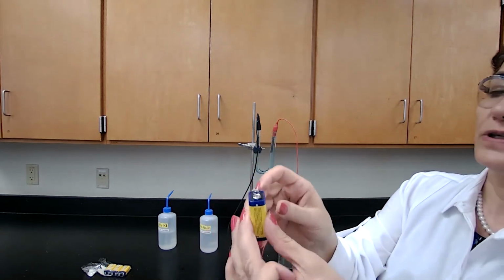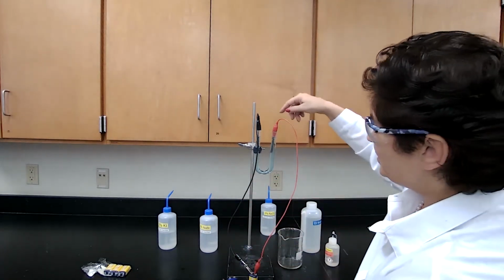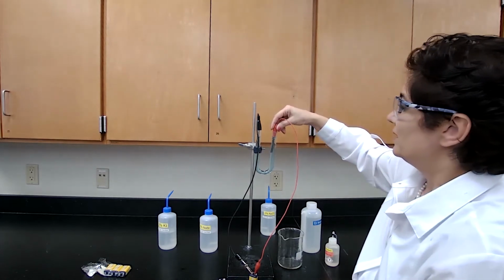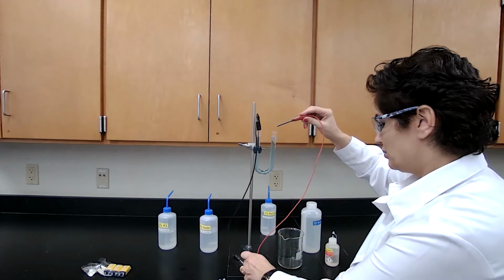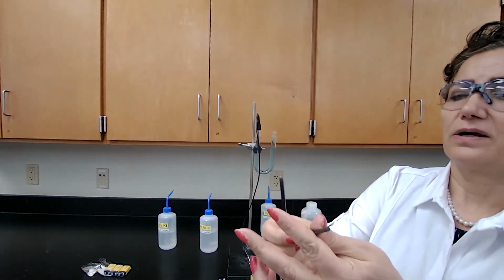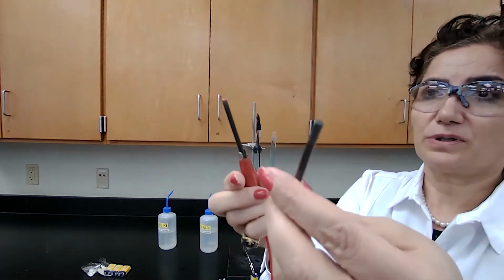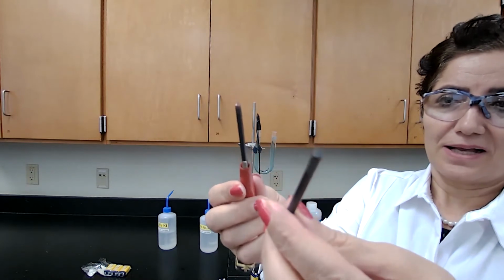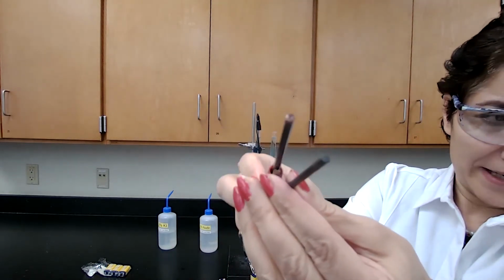So for the reduction, I should check this electrode, take it out and bring it to you to compare the before and after color. This is the electrode before being exposed to the electrolysis, and this is the after. It's not going to be very obvious.